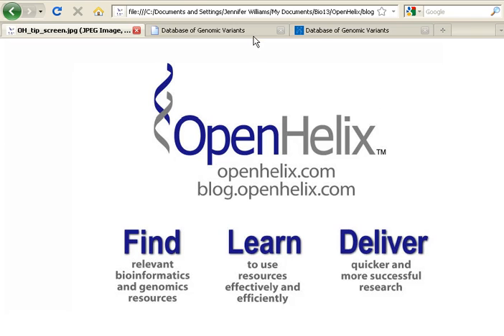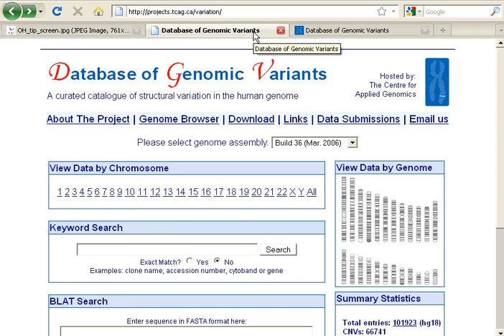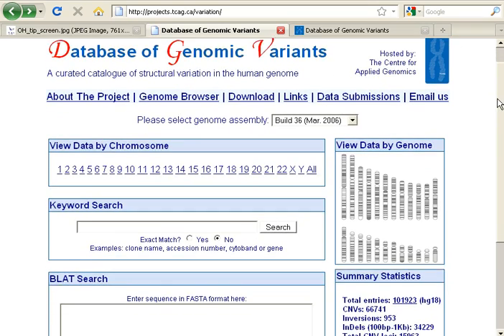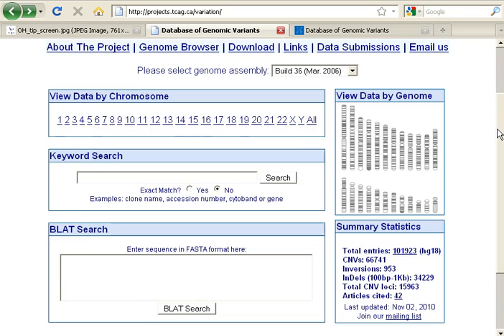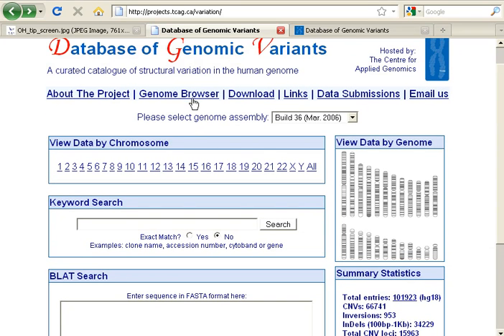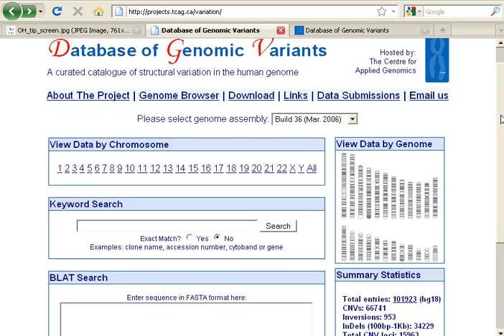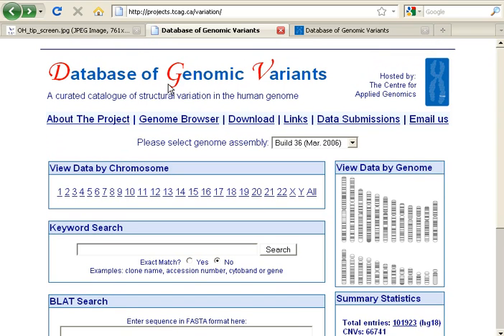In today's tip, I would like to explore the Database of Genomic Variants. If you're familiar with the original DGV resource, you'll recognize this as its home page. Here you can click to a genome browser, look at chromosomes, or do a keyword search. This original version of the DGV is available.